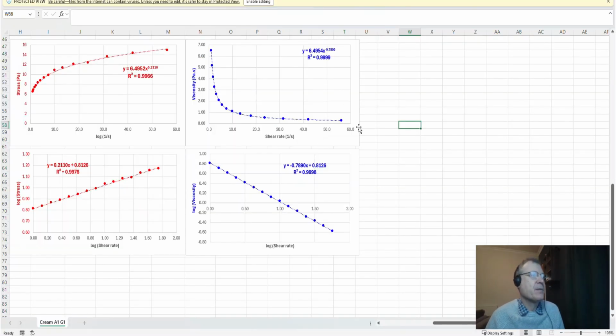Now, what you'll find is you should see a set of graphs come up first of all, and these are the end product of what we're really wanting to see in your report. These have been done for you, so you basically have to copy and paste them into your report and actually talk about these. The idea is to put proper notation on them, such as figure, and explain what's in the graphic, in the caption for each figure.